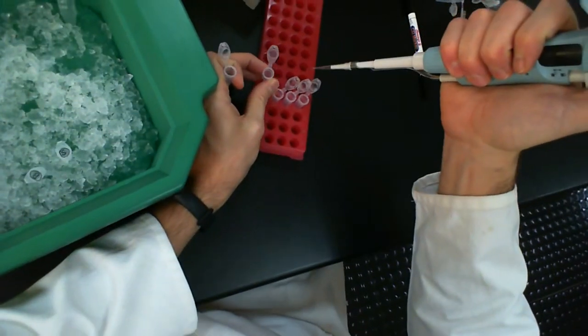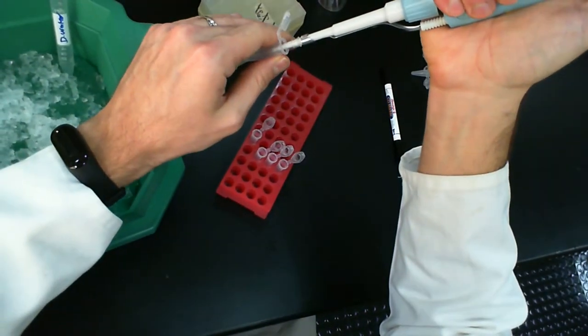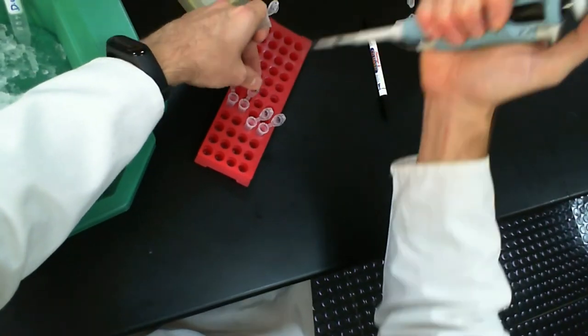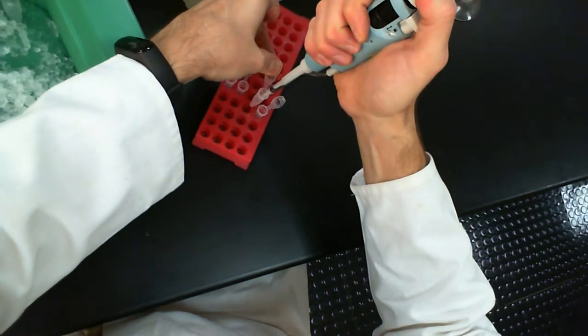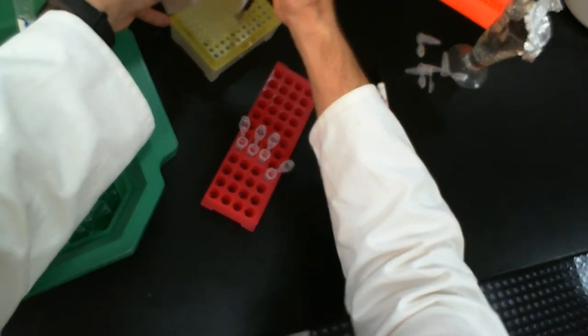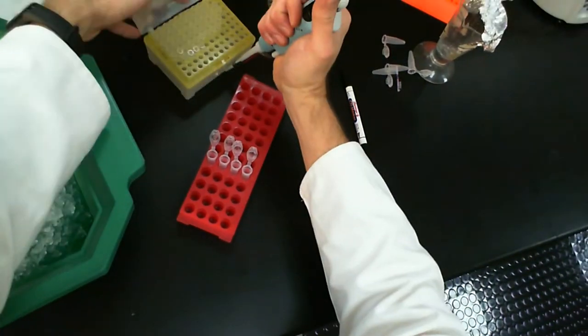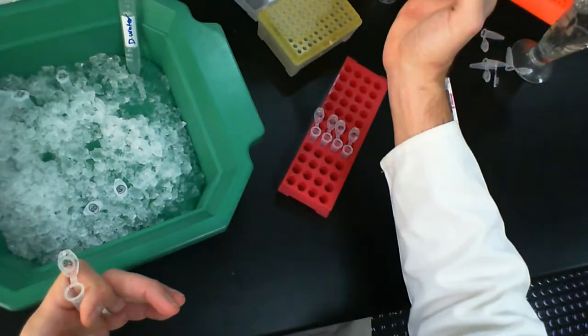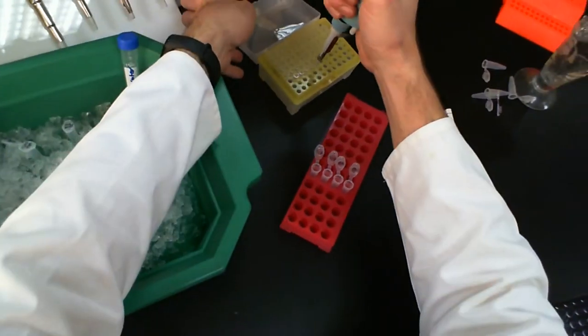Again, each time we're going to change tips. So BSA is done here. Next tube goes in. Again, notice that I am opening up the lid of the tips each time and closing it. This way I minimize the risk of contaminating the rest of the tips. So a lot of the times I see students just kind of leave this thing open like this for the whole lab. At that point, those tips are no longer sterile. There's no guaranteeing that these things are sterile at this point. So you want to make sure that you keep these closed as much as possible.